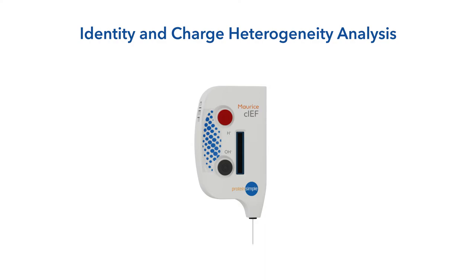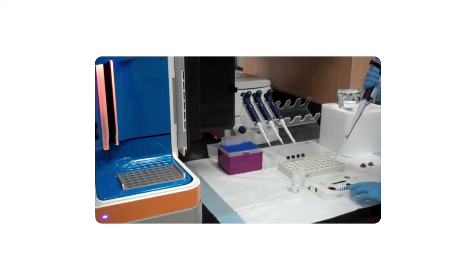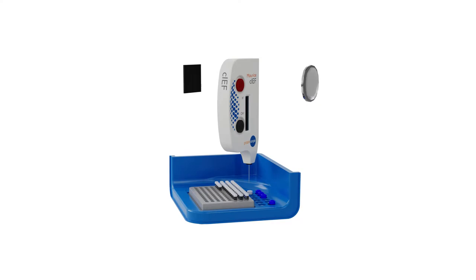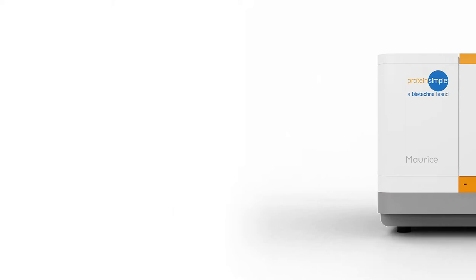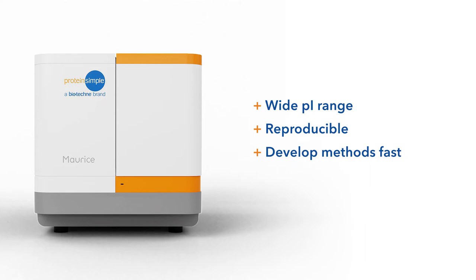Now let's look at identity and charge heterogeneity analysis of your biologics with CIEF. Simply add electrolytes into the tanks of your cartridge and insert into the Maurice. Load your samples and reagents, then close the door. The sample is injected into the cartridge based on the location you define in the batch. Whole column imaging with detection allows you to monitor the separation in real time. Maurice collects data in both absorbance and fluorescence modes for each injection, then automatically analyzes the data for you. With a simple streamlined workflow and wide pI range, get results in just six to ten minutes.